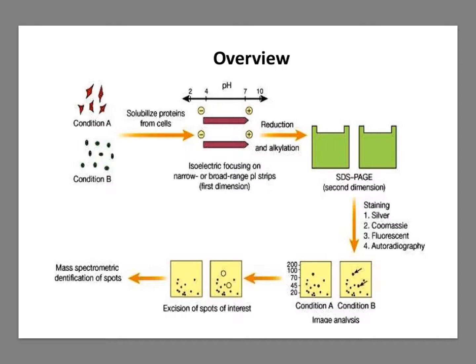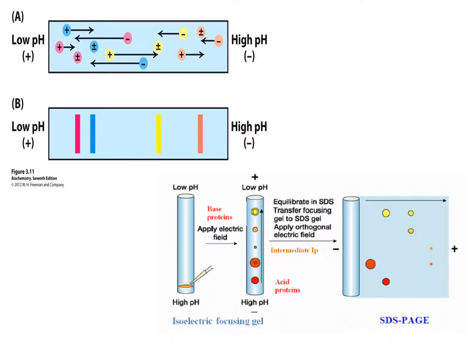So this whole process, you may have heard the term proteomics. This is where we're looking top down at everything and trying to spot differences. So this was a big movement. When science was starting out as far as looking at proteins, we were stuck at the bottom, looking at proteins one at a time. Here we're looking at all the proteins across the landscape and seeing what's different, which proteins are highly expressed, low expressed under the conditions, and I'm not defining the conditions. It could be diseases or other kinds of conditions.